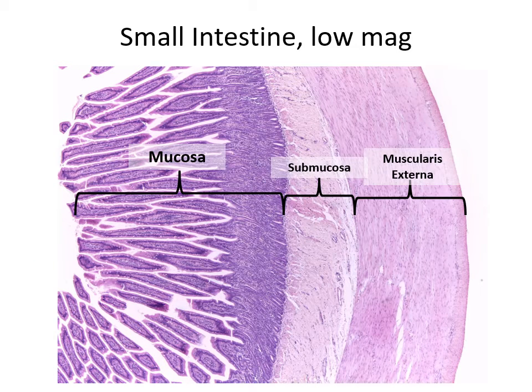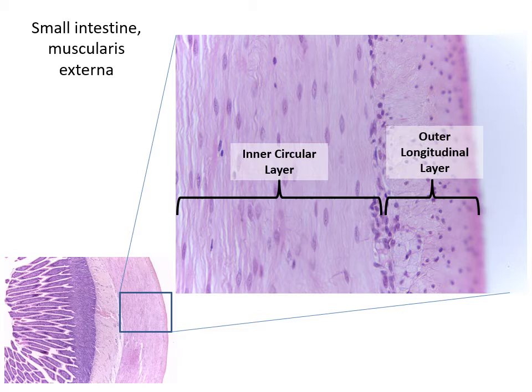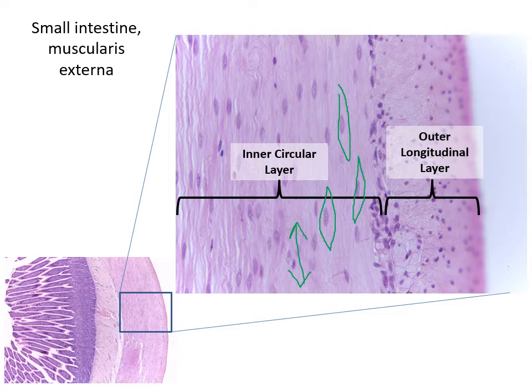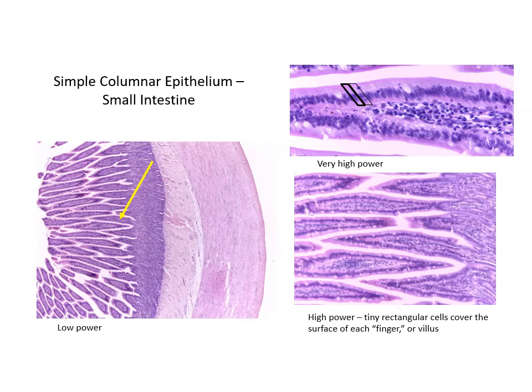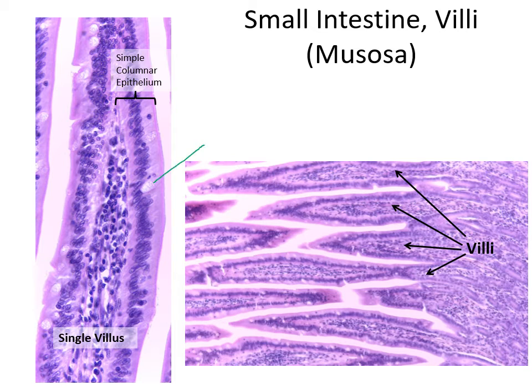Here's another image from our lab — again you can see the mucosa with these finger-like projections called villi, submucosa, and the muscularis externa. If we zoom in for a close-up of the muscularis externa, we see the inner circular layer — here's an individual smooth muscle cell, here's another one oriented in that direction — and then the outer longitudinal layer where they're actually coming out toward us. Here's another example with a close-up on a villus where you can see the individual simple columnar epithelial cells and the goblet cells.